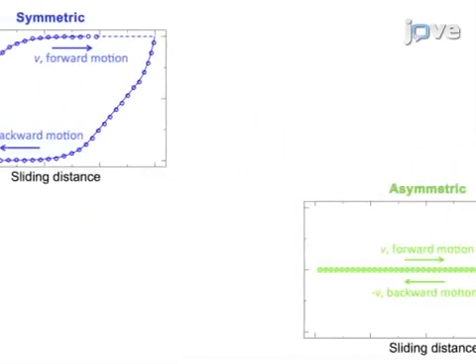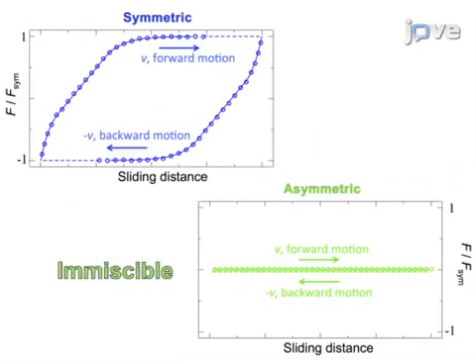The results show that the friction for immiscible systems is approximately 1% of the friction for the traditional miscible systems, as measured by friction force microscopy. One key advantage of our technique over existing methods based on industrial oils is that a low viscosity liquid is kept in the contact even when conditions are harsh at the microscopic scale, as it happens when you have surface irregularities bumping into each other.